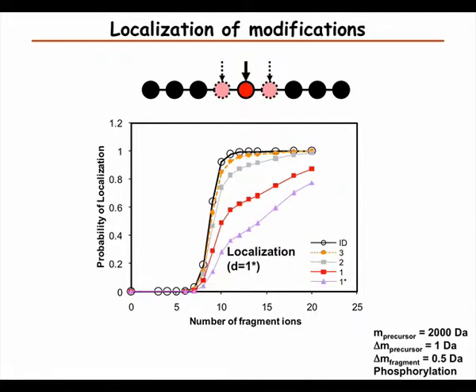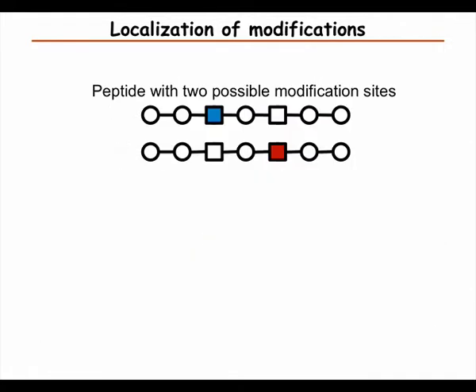And if we have a possible site, this is the most difficult case: the real site is in the middle, and we have 1 possible site on each side. Then in this case we need much more information to localize. So this is something to think about: if we have sites close to each other, we really need to have much better experimental data to be able to localize.